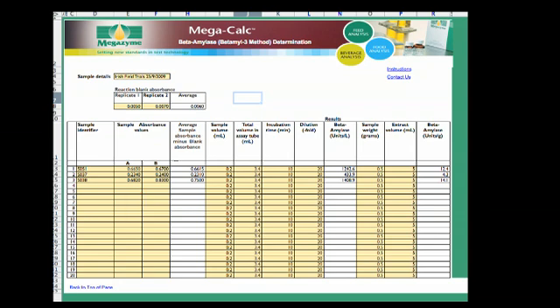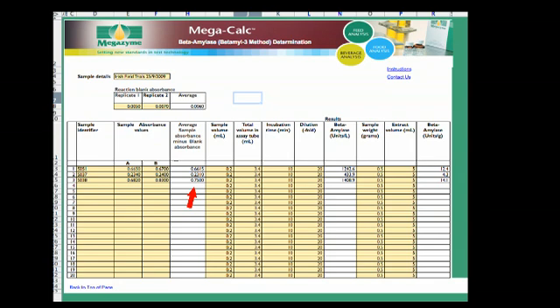On the assumption that the method is followed as written in the booklet, the sample volume will be 0.2ml, so it's not changed. But it can be changed if a smaller volume or a larger volume is used in the assay. The total volume in the assay tube is 3.4ml according to the method, so that won't be changed unless the method's changed. Incubation time is 10 minutes. Dilution is usually 20-fold, but again that can be changed if it's changed in the method. This will then calculate beta-amylase activity in units per liter. And when the sample weight is entered and extract volume in milliliters, beta-amylase in units per gram is calculated.